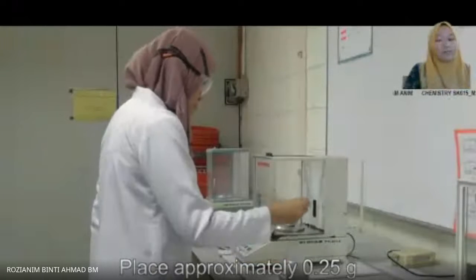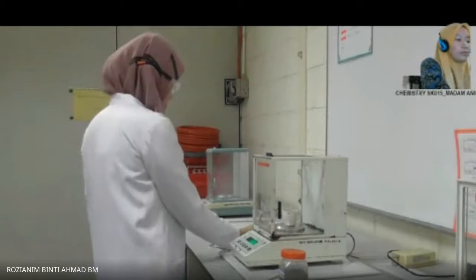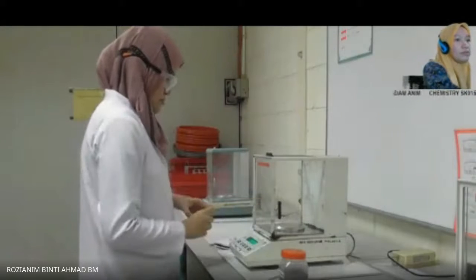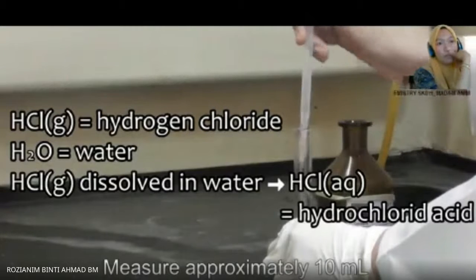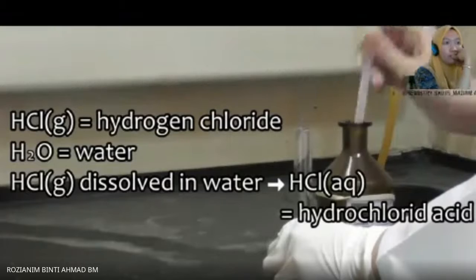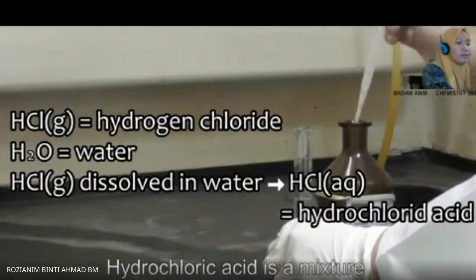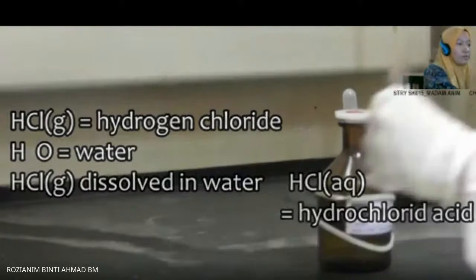Place approximately 0.25 grams of zinc into the crucible and record its exact mass. Measure approximately 10 milliliters of 6 molar hydrochloric acid using a measuring cylinder. Hydrochloric acid is a mixture of hydrogen chloride and water, while pure hydrogen chloride exists as gas at room temperature.